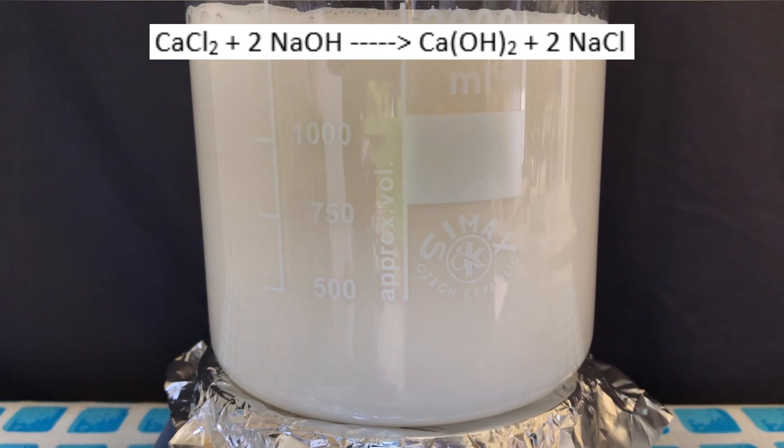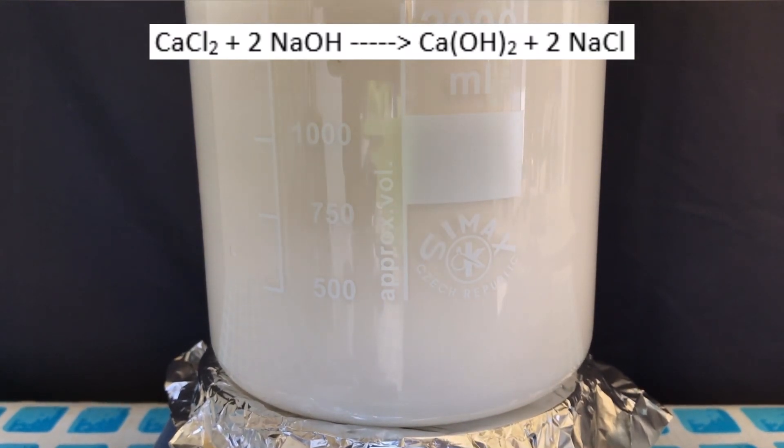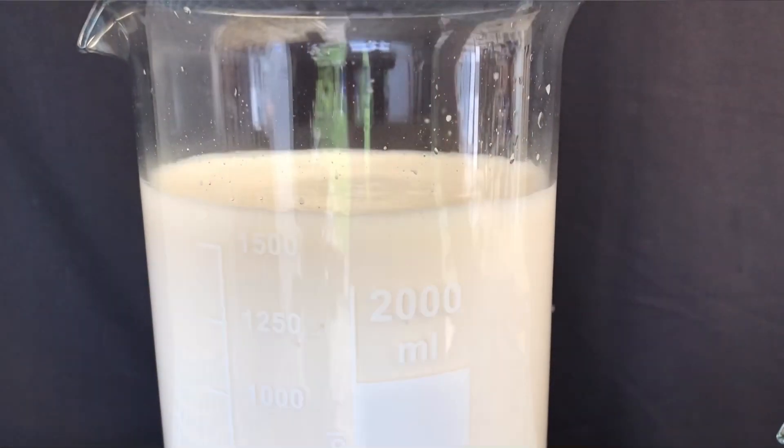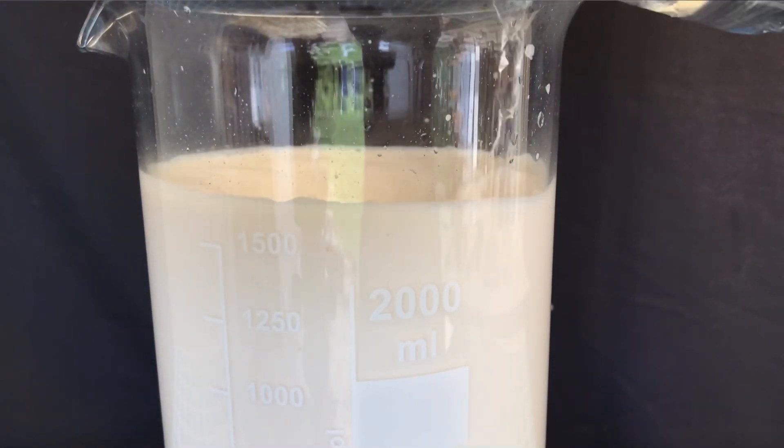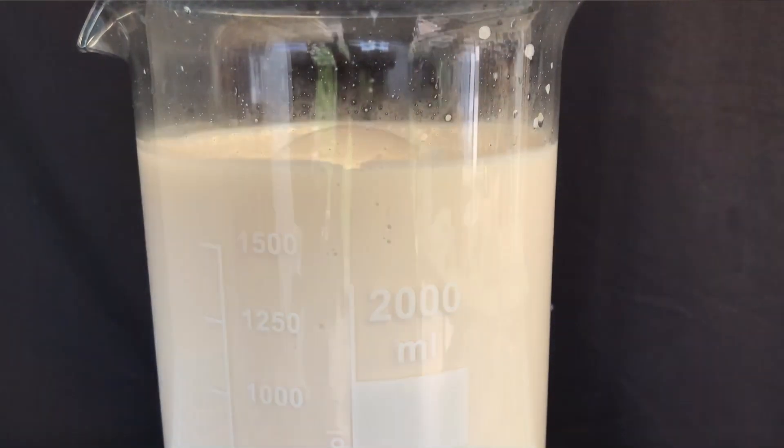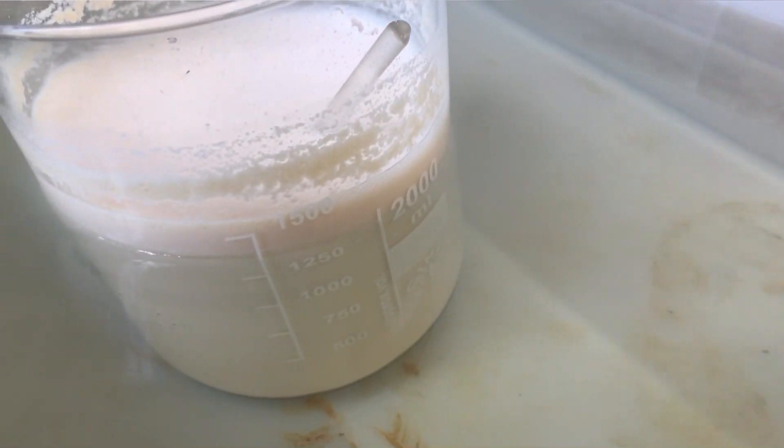Here's the reaction. Calcium chloride reacts with sodium hydroxide to form calcium hydroxide and sodium chloride. It would be possible to use calcium hydroxide directly, but by generating it in the beaker, you get extremely fine calcium hydroxide, which reacts with the hydrogen peroxide even better, because it has a high surface area.